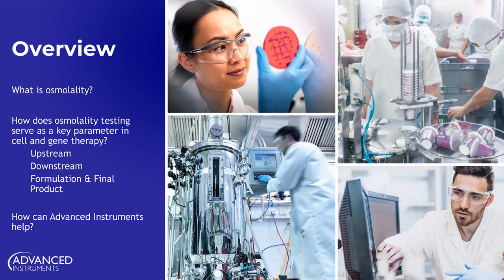I'd like to start with an overview and a brief agenda of what we'll be discussing today. I'd really like to start with just the foundation, some of the groundwork. What is osmolality? There are a lot of properties that are mentioned and discussed throughout the literature when it comes to describing colligative properties of solutions. So let's just start there with some basics, and then we'll really start to dig into the meat of this, which is how does osmolality testing serve as a key parameter within the cell and gene therapy field?